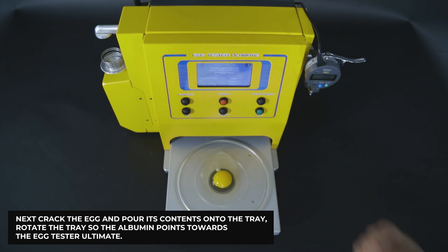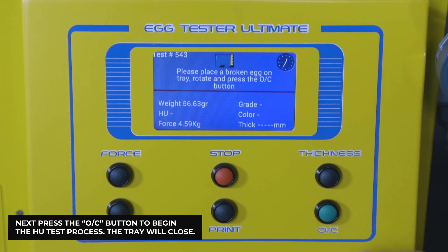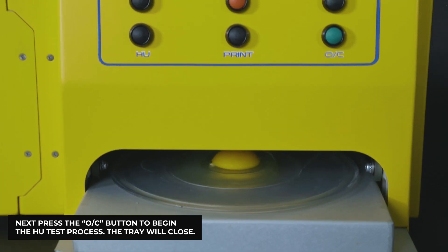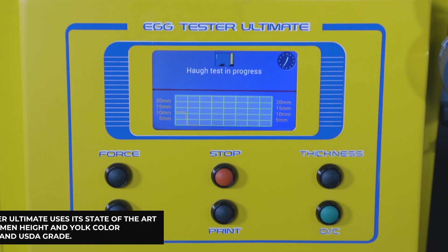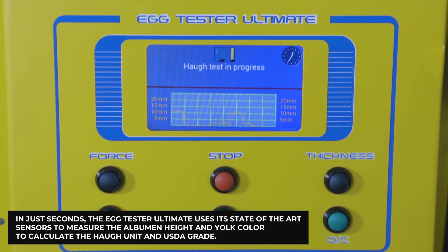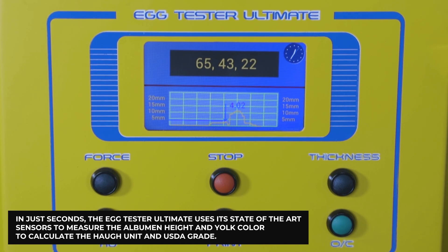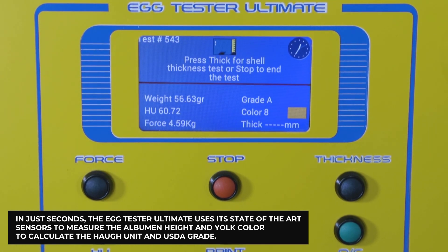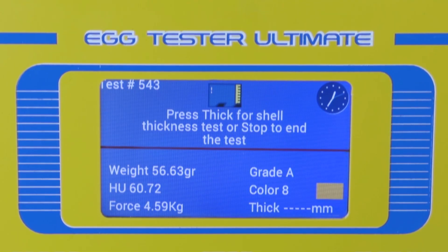Next, crack the egg and pour its contents onto the tray. Rotate the tray so the albumin points towards the Egg Tester Ultimate, then press the OC button to begin the HU test process. The tray will close, and in just seconds the Egg Tester Ultimate uses its state-of-the-art sensors to measure the albumin height and yolk color.